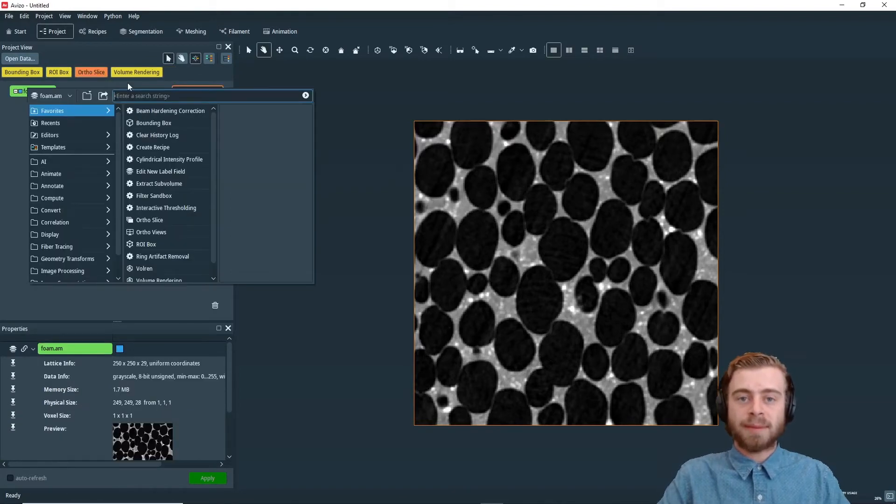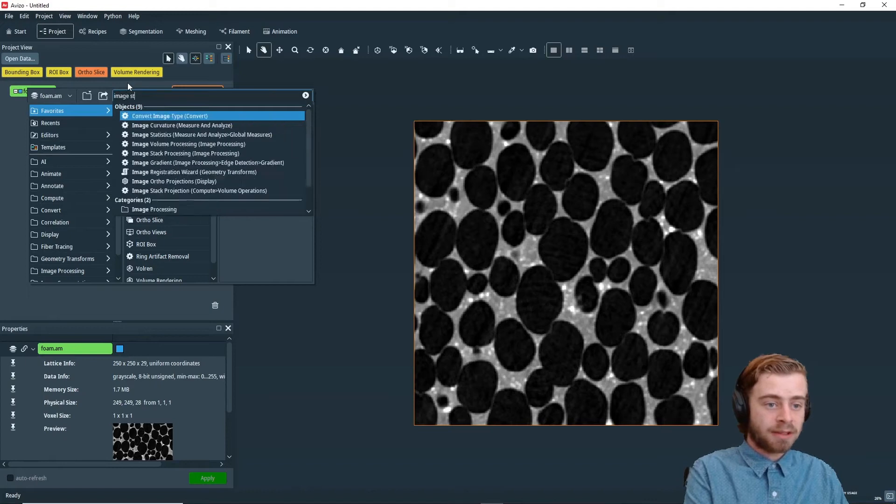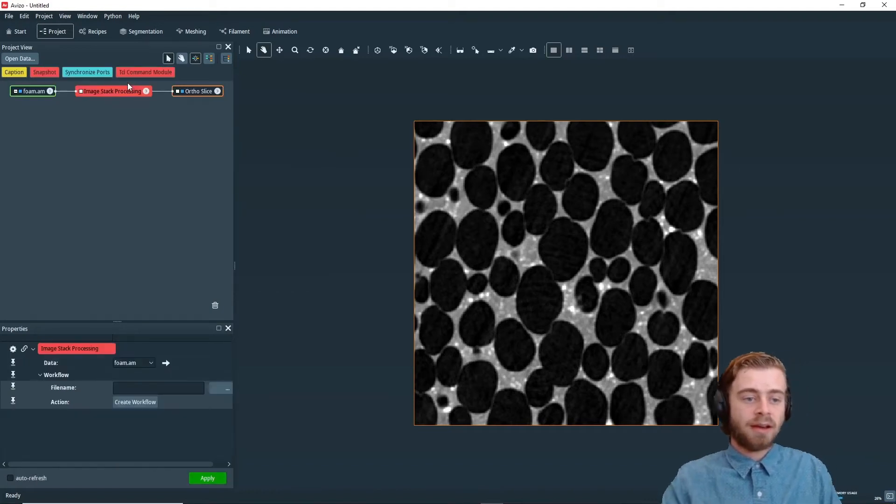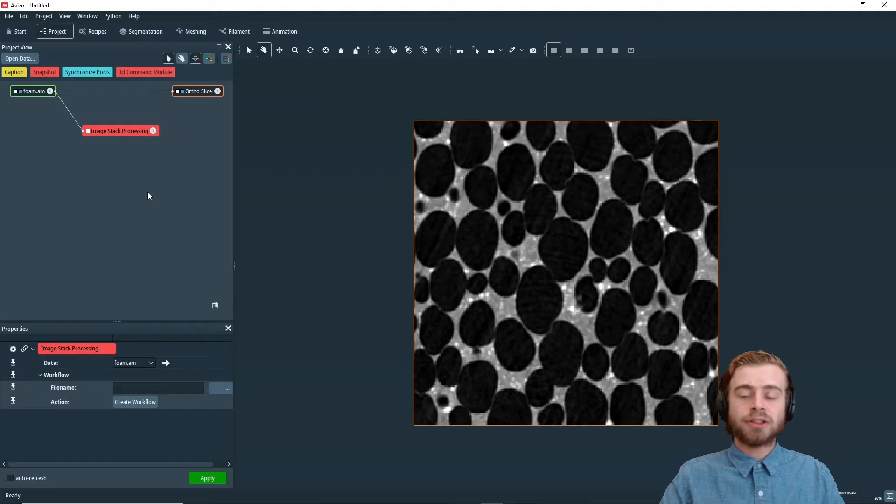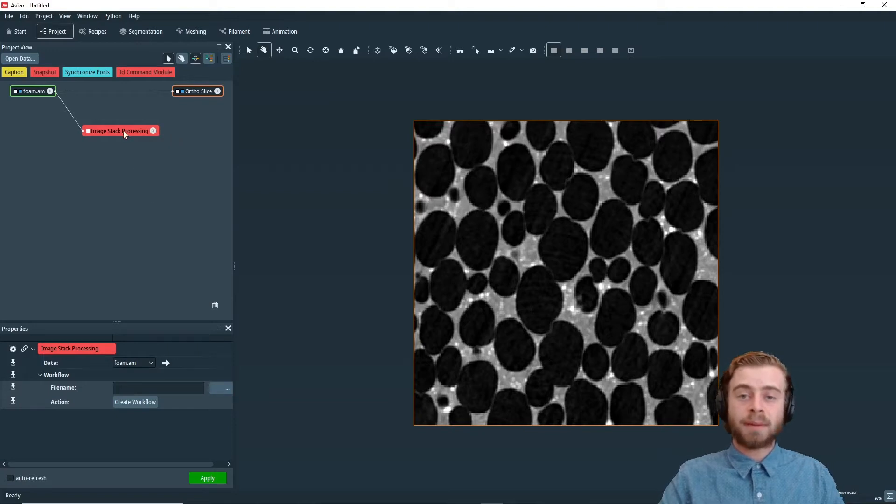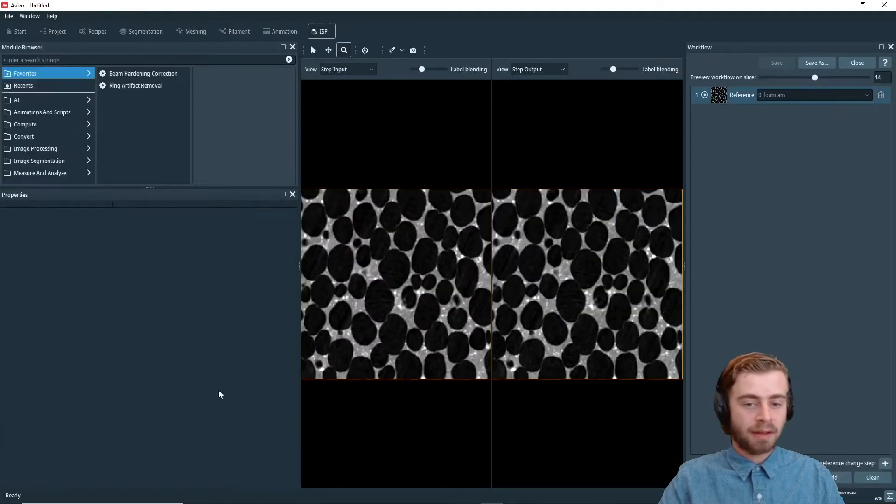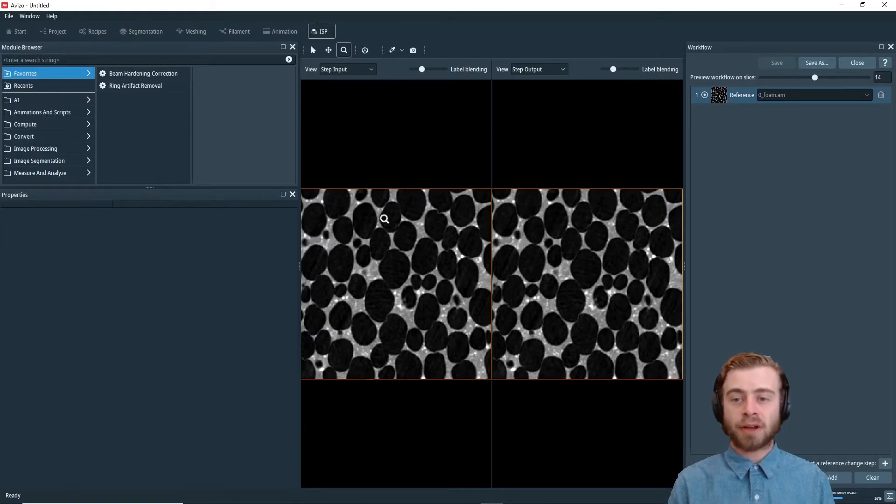So now that we've opened Foam, we're going to create an Image Stack Processing module. So we're going to type in Image Stack Processing, and there we go. So to create the workflow, we select the Image Stack Processing module and click Create Workflow. This opens the Image Stack Processing workroom.